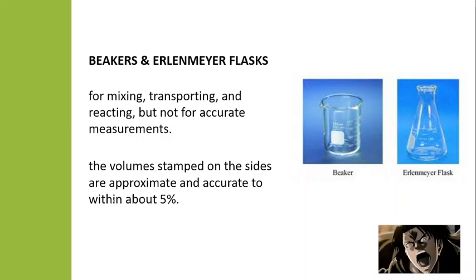Next are your beakers or your Erlenmeyer flask. It is used for mixing, transporting, and reacting, but not for accurate measurements. Okay, the volume stamps on the sides are approximate and accurate to within about 5%. So makikita nyo sa laboratory demonstration natin later on si Erlenmeyer flask at saka si beaker.